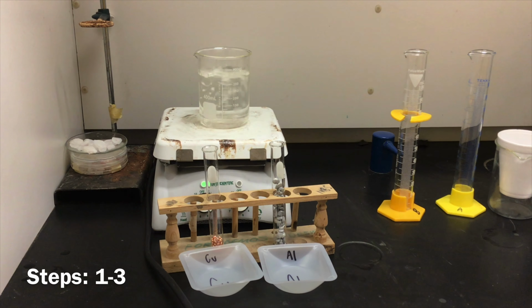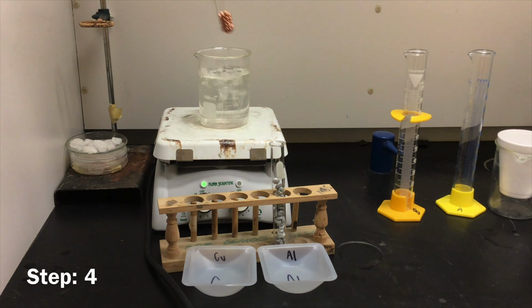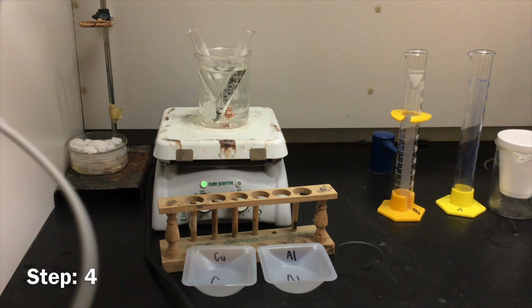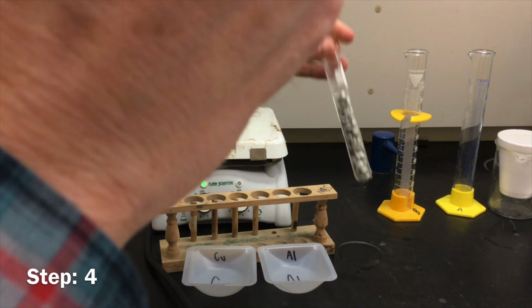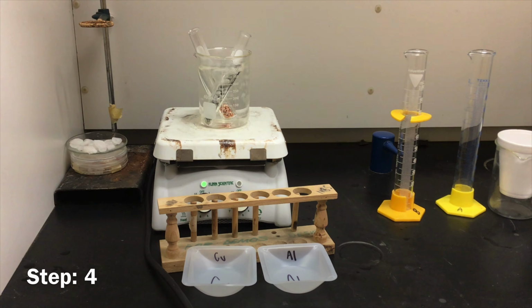I've transferred the copper and the aluminum into their corresponding test tubes. The copper is, for lack of a better term, copper or orange or bronze in color. The aluminum is gray or silver in color. Now I'm going to transfer those to the hot water bath. So that's 20 grams pre-measured. Both are fully submerged. All of the metal, shake this one down a little bit. There we go. I want to make sure all the metal is underneath the surface of the water, which it is. I'm going to let that cook now for approximately 5 minutes.